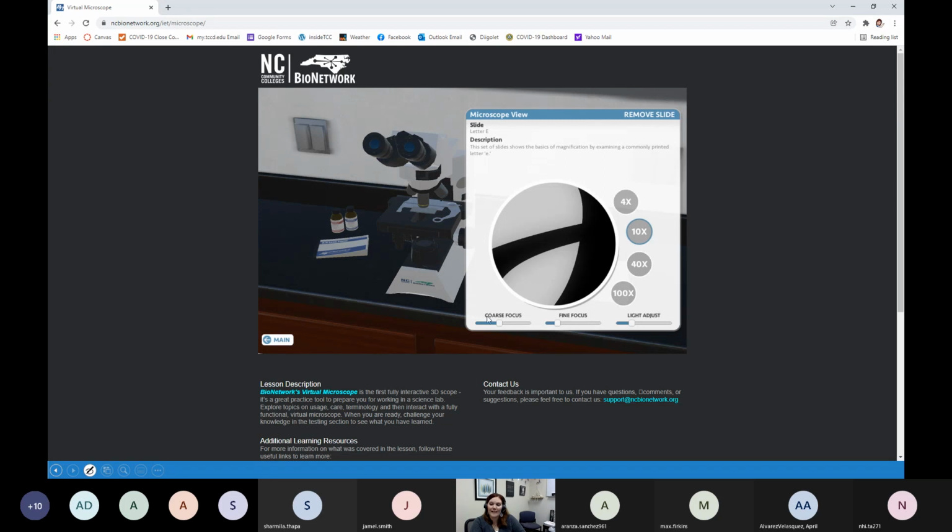All I need to do, remember, I cannot touch this guy. Coarse focus is done. Don't touch it. I can play around with this if I want to make it even a little more crisp. Because I have the yellow objective in place, I cannot touch this one anymore. Coarse adjustment knob off the table.